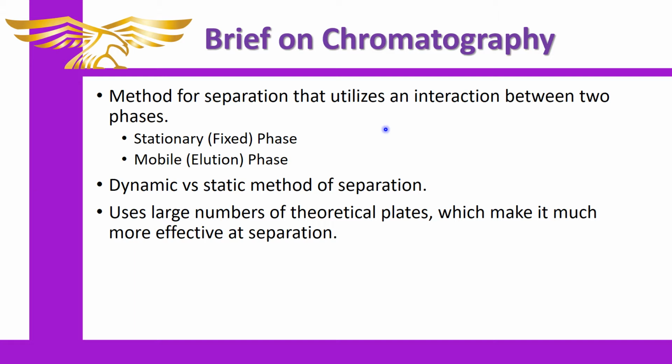Now, there's a big difference here in regard to the theoretical plates you'll find in chromatography columns versus a fractional column, because you don't calculate the theoretical plates entirely the same way. It is true that the column length is still probably the most important factor, but you also have to look at things like your bed volume, and sometimes the retention times for different compounds can be different, and so this can change your plates too because it's very experiment specific.